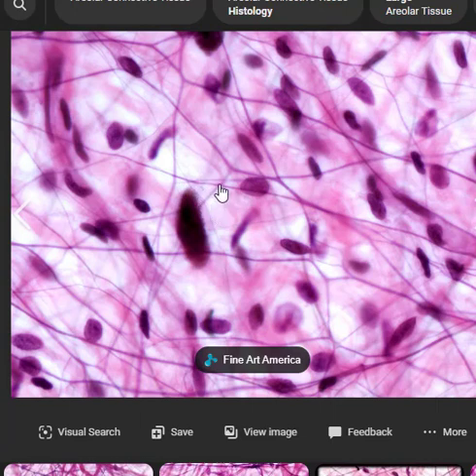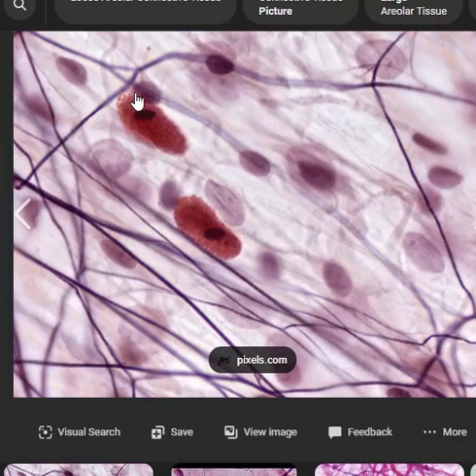It is full of little bags of histamine. And you guys know about histamine because when you get a cold, your nose gets all swollen, your eyes get swollen, your throat gets swollen. So this would be histamine being released. And what you usually do is you take an antihistamine, like Benadryl, to try and dry up the histamine effects so that you don't have all the fluid. Here's one even more close-up, and you can see the individual bags of histamine in those mast cells.